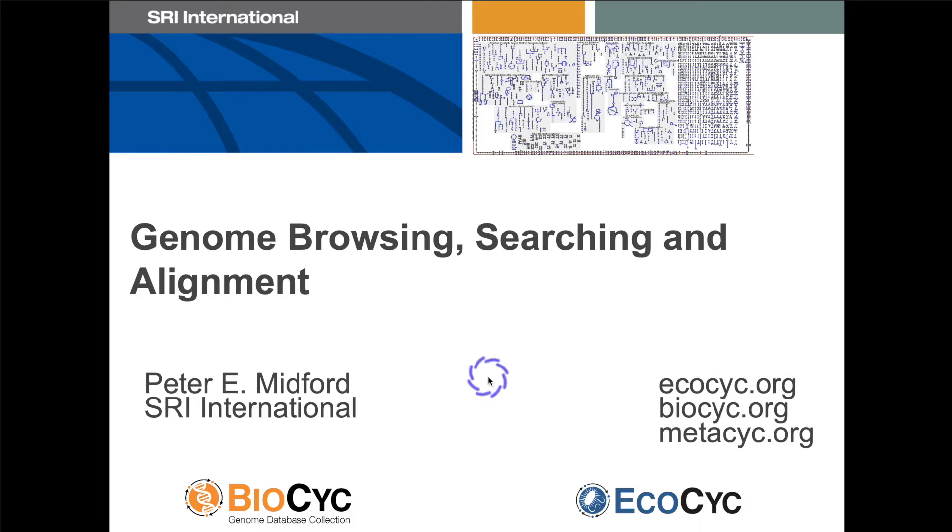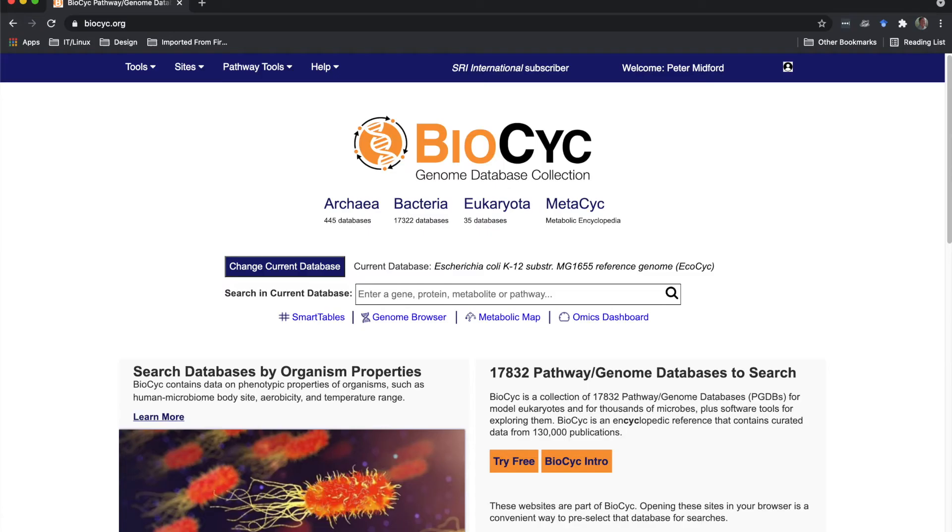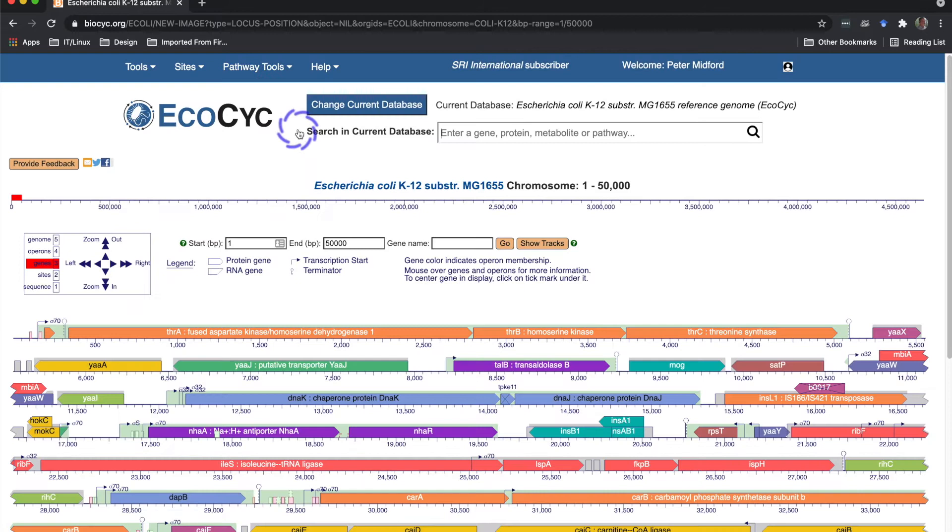I'll start by showing you how to use the genome browser. There are several ways to access the genome browser. The easiest way is from the tools menu—go over to genome and genome browser. This browser browses a single replicon, so if your organism has multiple replicons, for example E. coli chromosomes, you'll see a page to select one first.